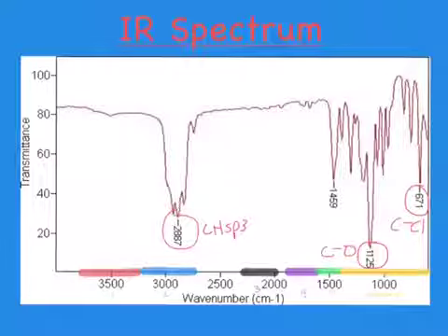So from this IR spectra, I have found that it most likely contains an ether, an alkane, and an alkyl halide somewhere in the molecule. Further analyzing of more spectra will confirm this.